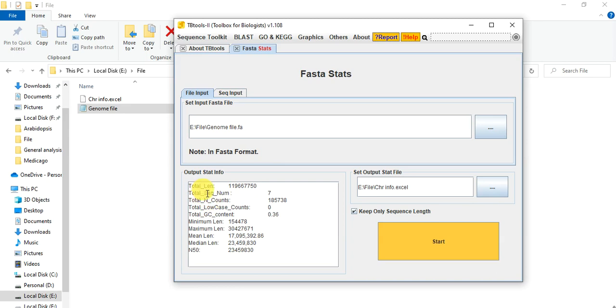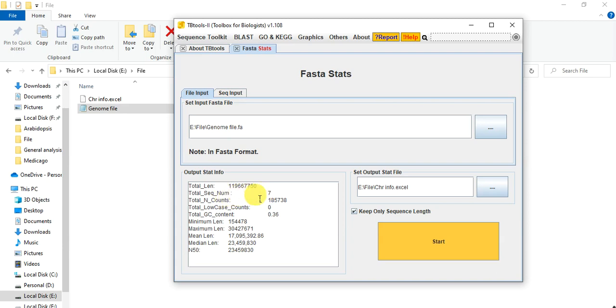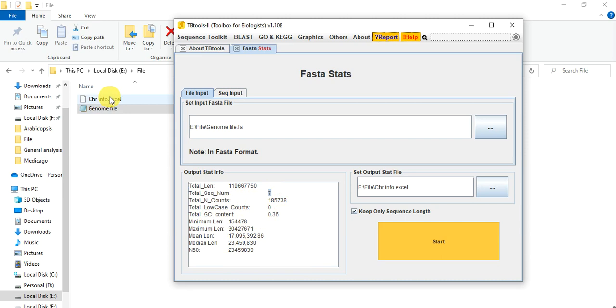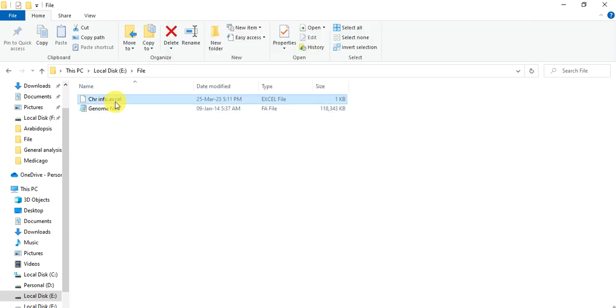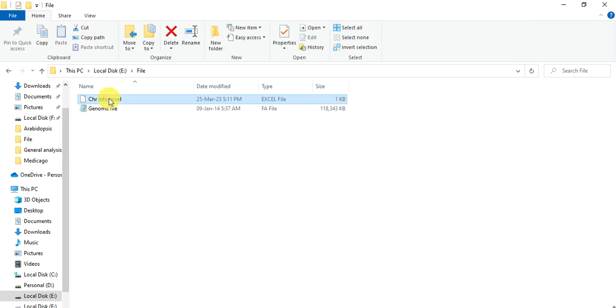So here are some information that are in chromosome length of each of total genome and there are the total number of sequences like chromosome number. And it includes the mitochondrial and chloroplast chromosomes. And other information are GC content. And this is our file in which our information is saved. So we can open it.